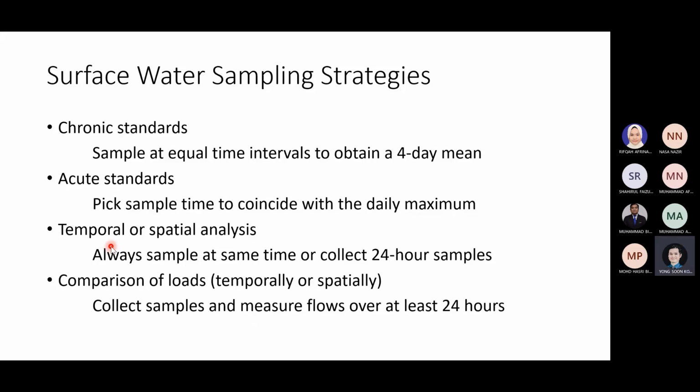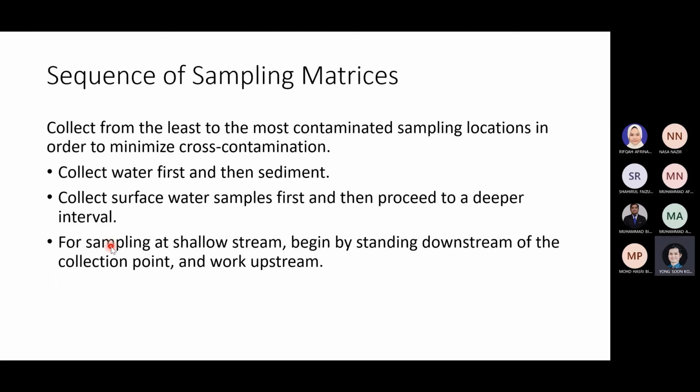Yeah. So it's also very much dependent on how much time that you have from collection to analysis. Again, if it's too long, it may not be valid. And then, like I said to you just now, the sequence of sampling, because when we go into the site and collect samples, we might cause a little bit of disturbance. So, like I said, collect water first and then the sediment. Because when you touch the sediment, it will come out and disturb the water quality. Yeah, we try to avoid cross contamination.